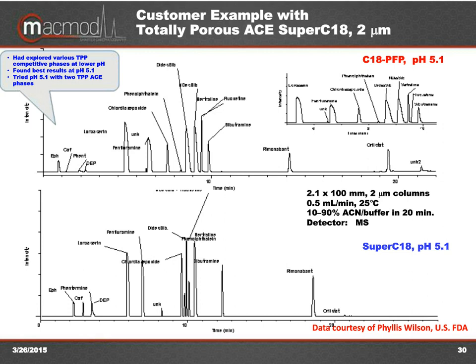And she had tried, I think, some different C18 phases as well as a phenyl phase from some competitors, and gave us a call. I thought it would be a good opportunity to work with her, not only to see how some of our totally porous phases worked, but also to see how well the totally porous Super C18 phase worked.